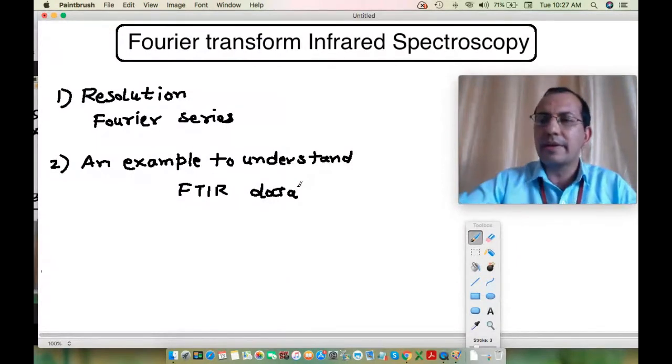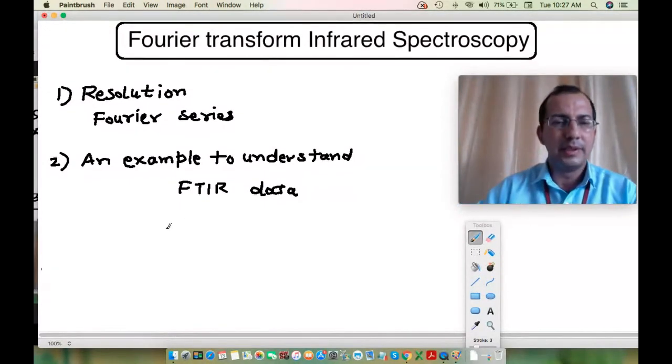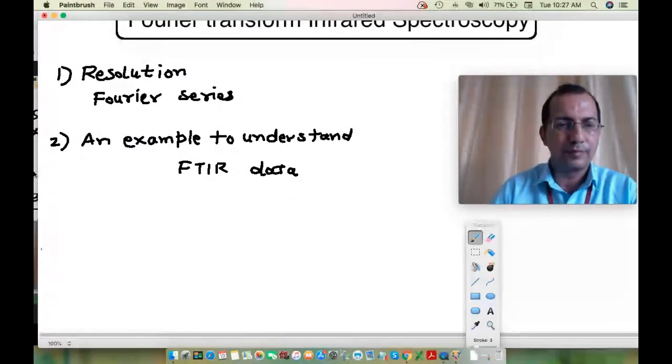Let's say the distance traveled by the mirror, or the retardation, is 4 centimeter.